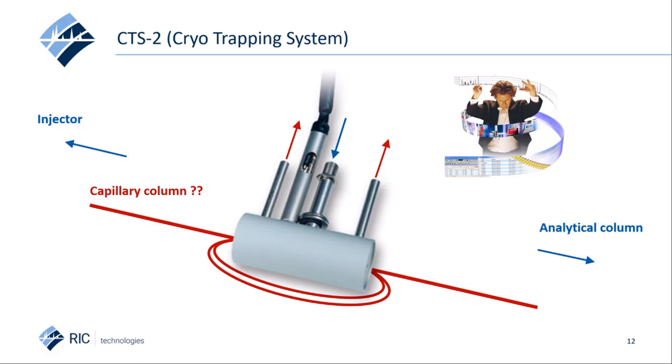Transfer is rather slow, still using of course the standard narrow 2 mm headspace liner in the injector, but the volatiles are refocused at a cold trap, based on the cooling temperature, number of coils through the cold trap, and in some cases the combination with the stationary phase present in the capillary, situated in the cold trap. All parameters of the cold trap must be controlled and programmed in the software, with high importance towards the speed of heating the device, which in fact is the real injection towards the analytical column.